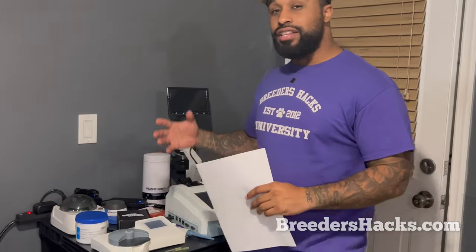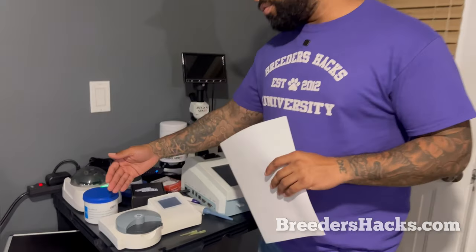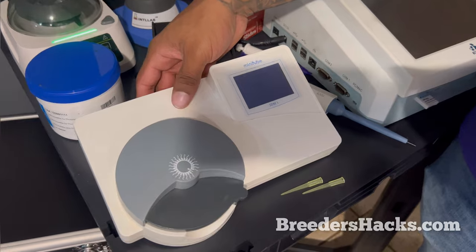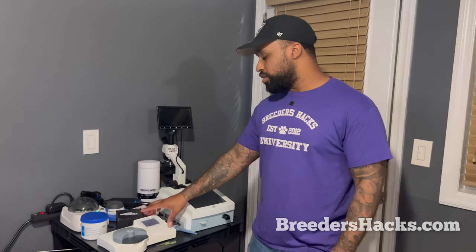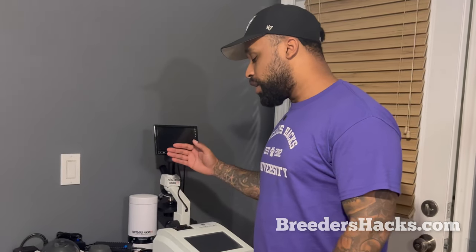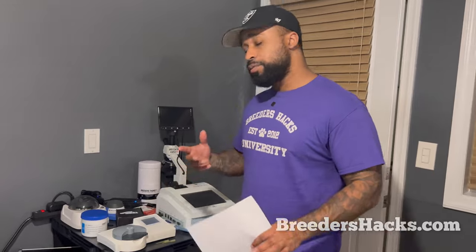So today I got some really cool, fun equipment. Personally, one of my favorites. This is something that you don't see really utilized here in the United States as much as in Europe. That's actually where these come from. And these are photometers from Minitube. This is something new that I wanted to share with you guys that is going to be great. It's going to be amazing when it comes to evaluating semen. We already have our microscopes that we use, but this is something that goes hand in hand with that. And I'm going to explain why.